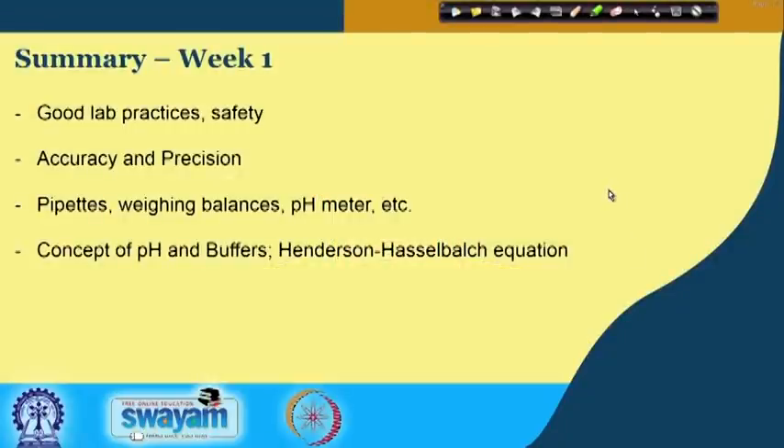Hello. In this first week of lectures we have talked about several things. I am going to summarize the important points of what we have learnt. We have primarily talked about good lab practices — for example, you should wear a lab coat, wear shoes in the lab, wear goggles when working with acids or bases, and wear gloves.